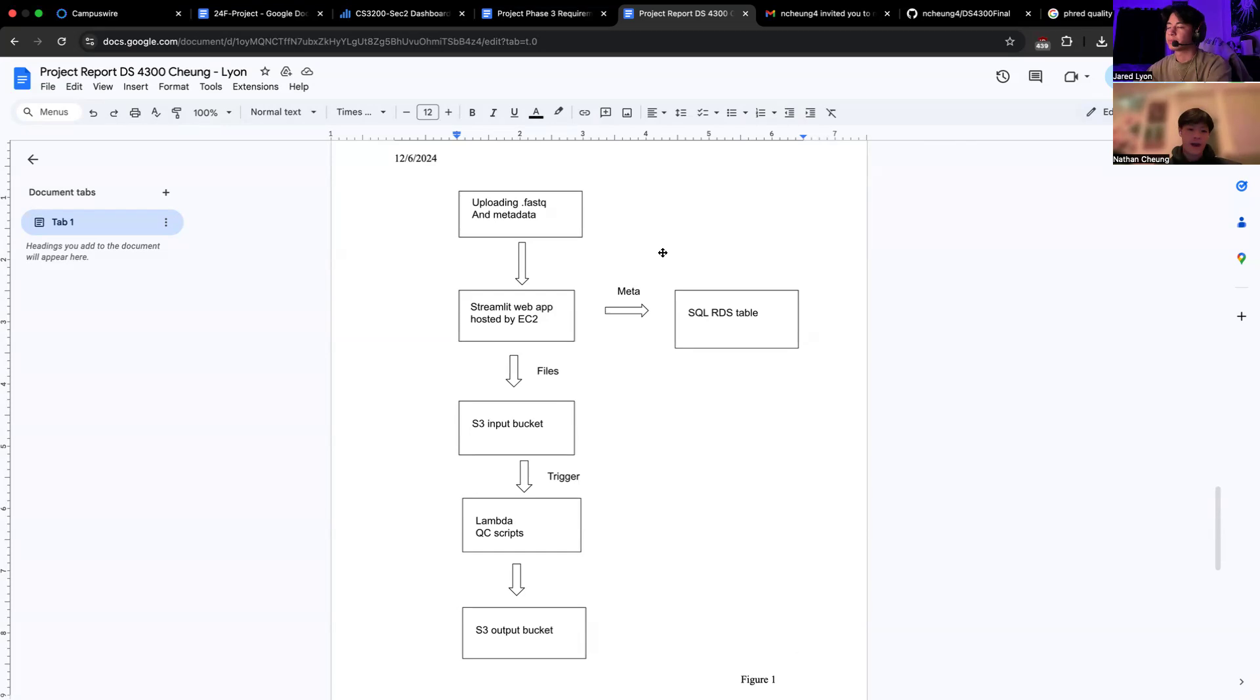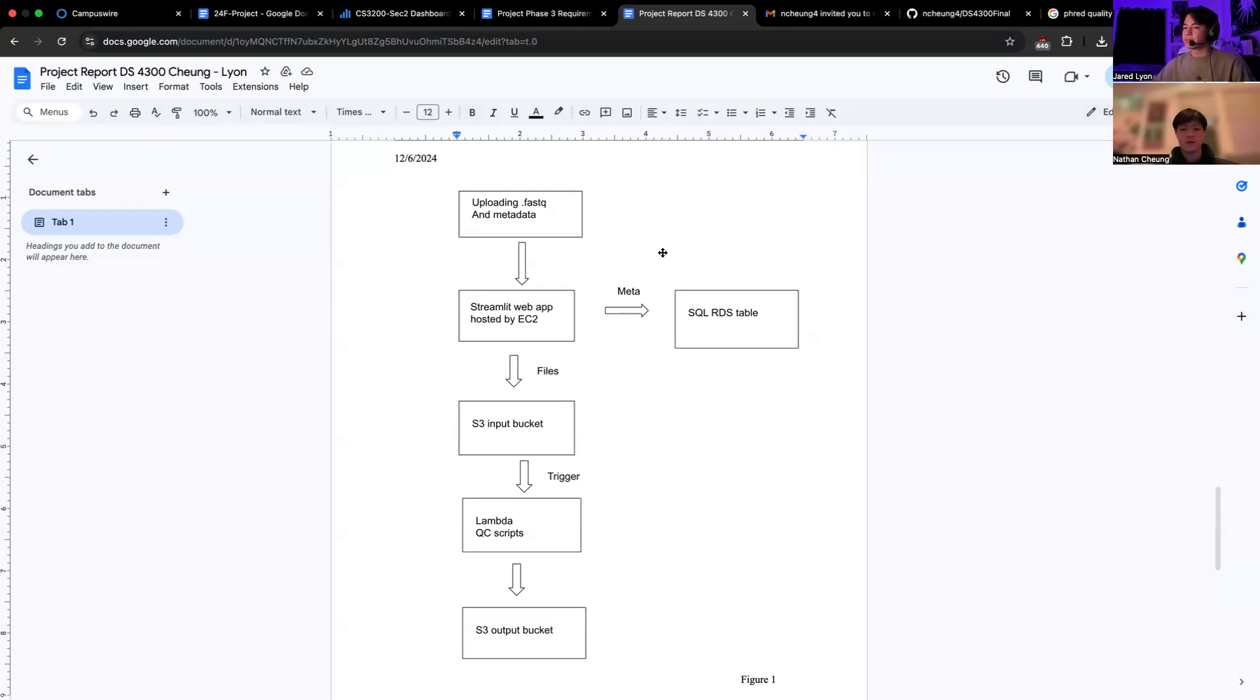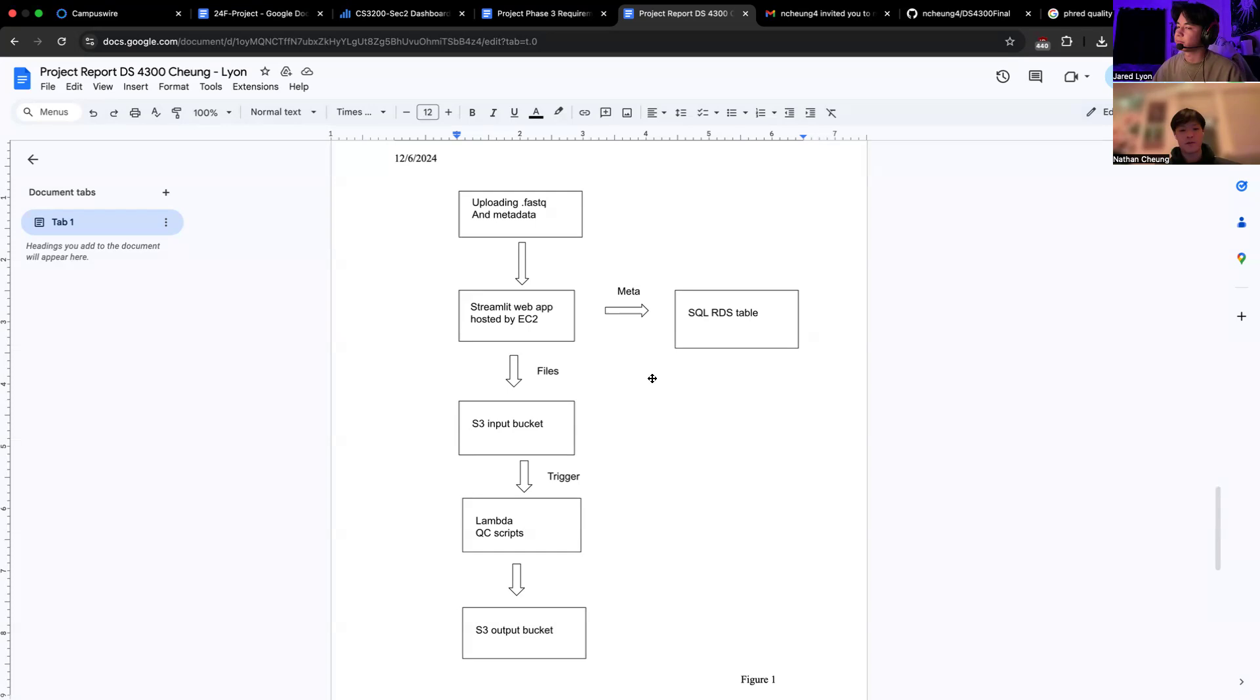Finally, we have the output to the S3 bucket, where the QC report is generated and stored in this output bucket. And we also accounted for the pipeline to include additional steps, such as alignment to a reference genome, producing BAM files for further analysis. And the user would be able to receive this report when it concludes.